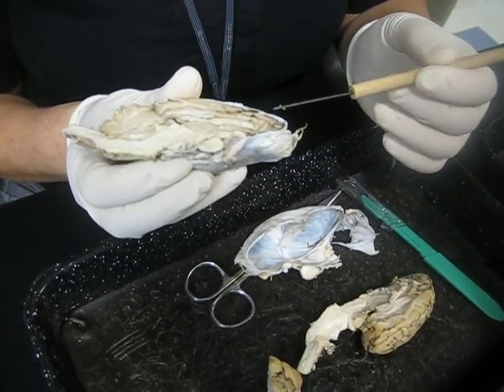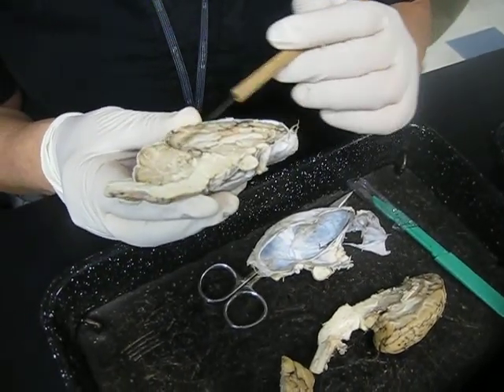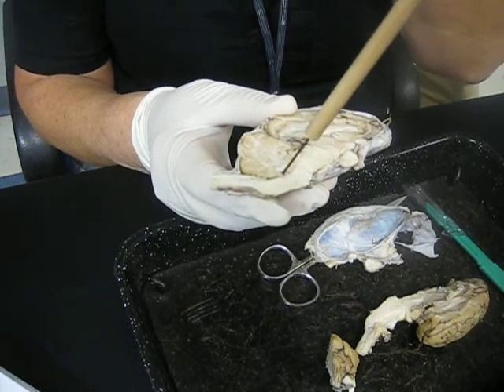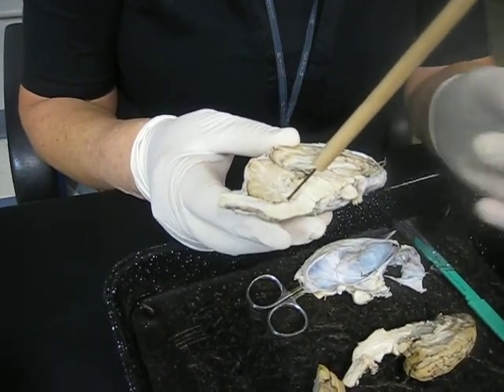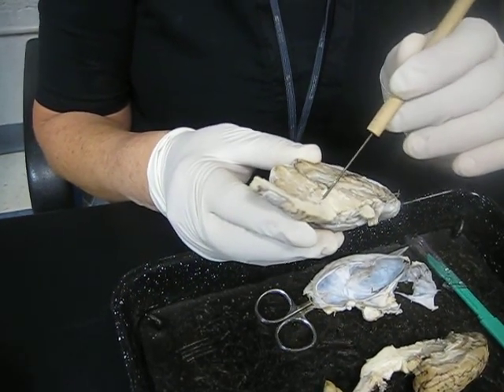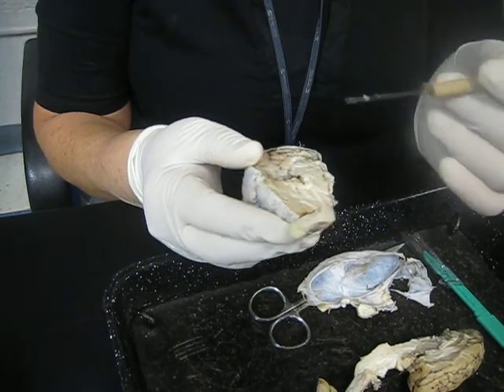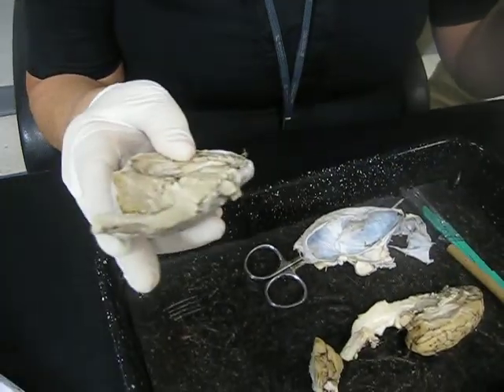Okay, what else do you need to know? This is the cerebellum, this is the arbor vitae, this is the 4th ventricle. The 4th ventricle, a ventricle is an empty cavity. It's not really empty though when you're alive, it's filled with CSF, cerebral spinal fluid. And it's connected to the 3rd ventricle through the cerebral aqueduct. And you can see the cerebral aqueduct coming up here, and this general area right here is the 3rd ventricle. You can see the 4th ventricle because you can put your stick in it.